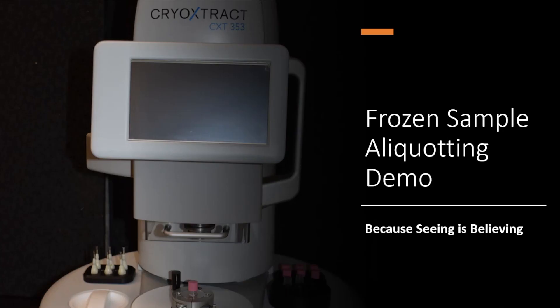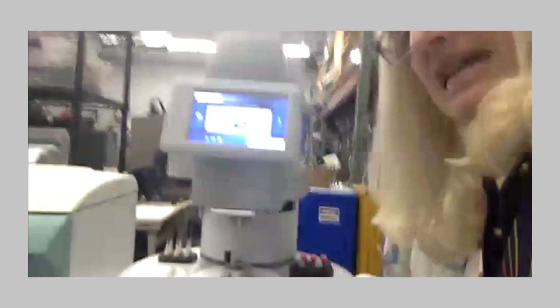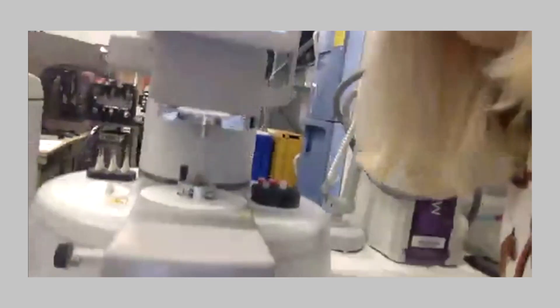I've talked about the instruments, the technology, why we want to do frozen aliquoting, what the benefits are, and what we offer. So now I'd like to do the demo. I'm going to get out of my presentation. Here is the CXT 353. I'm trying to get it to the point where everybody can see. Can everybody see that? That looks pretty good.